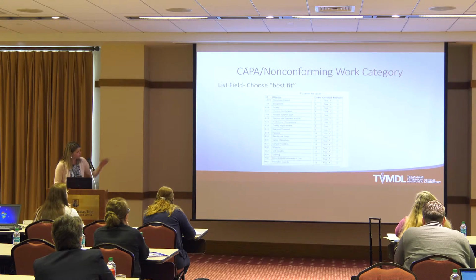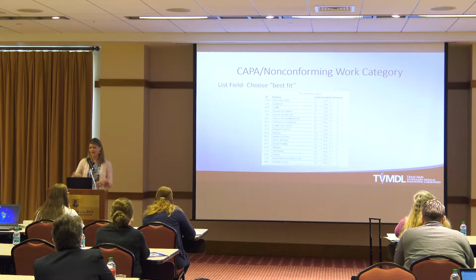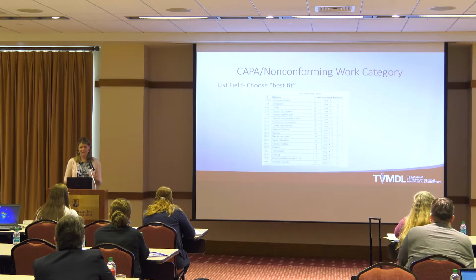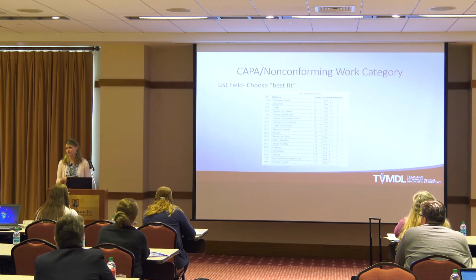We actually did that with document control, because you can see at the bottom, uncontrolled documents in use. So this would be someone made up their own form, and you perform an internal audit, and they pull a piece of paper out of the drawer that they're using, and you're like, where does that document come from? Well, we just made that, everybody in the section knows about it, everybody's using it, but it's not in Qualtrax, it's not controlled, nobody's ever seen it before. So we broke that one out of document control. We figured we needed to look at that a little bit more.